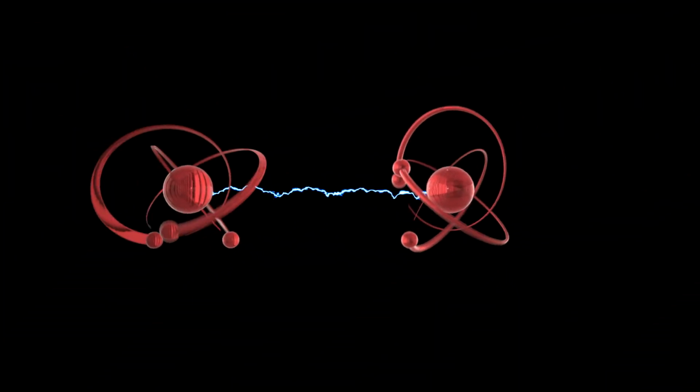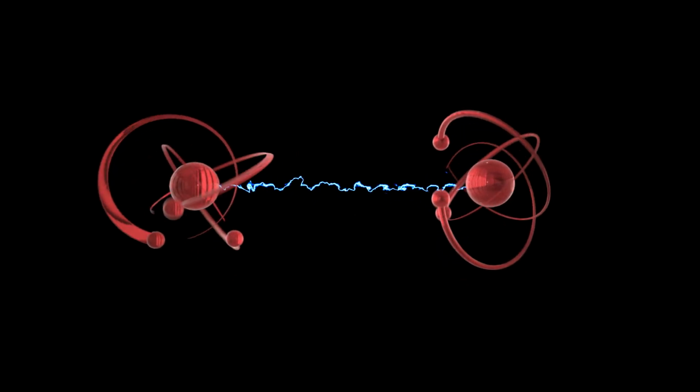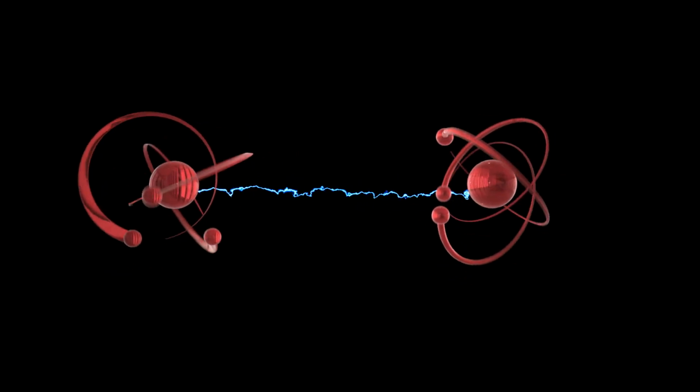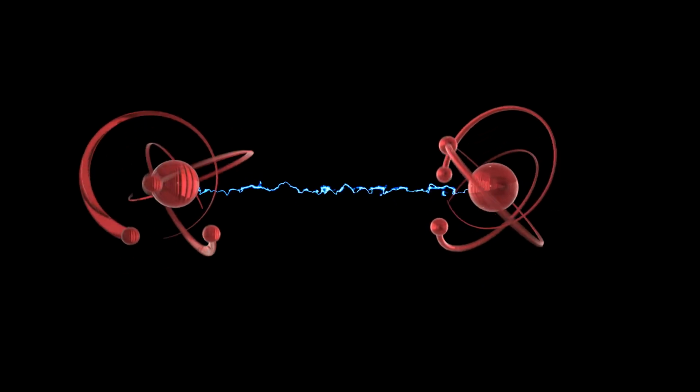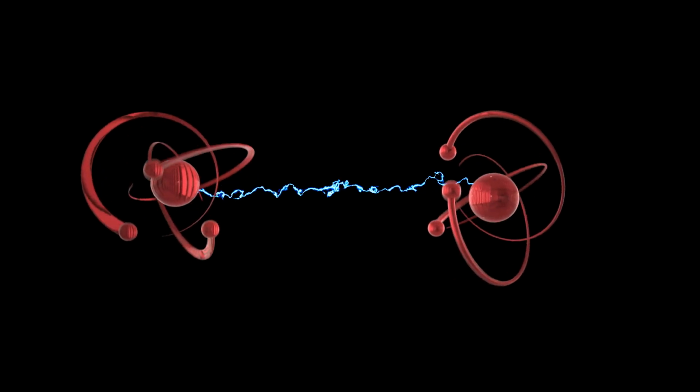Chemical bonds in a molecule can be viewed as springs connecting two atoms. When the atoms move, these springs vibrate at very specific frequencies that are characteristic of the bonds. A group of atoms in a molecule may have multiple vibrational modes caused by the stretching and bending motions of the group as a whole.